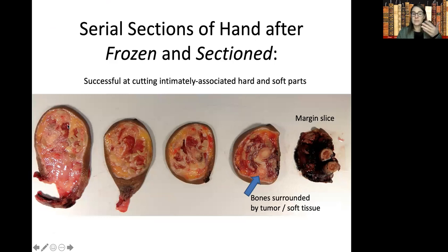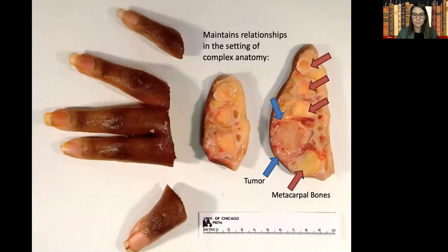And after the specimen has thawed, we've taken these photographs. And so it essentially, again, looks fresh. Colors, right? Fresh, bright yellow, fresh, bright red, because this has never been placed in formalin yet.